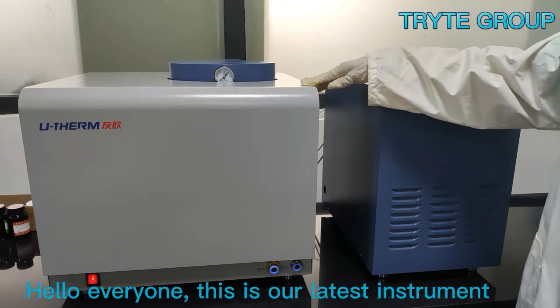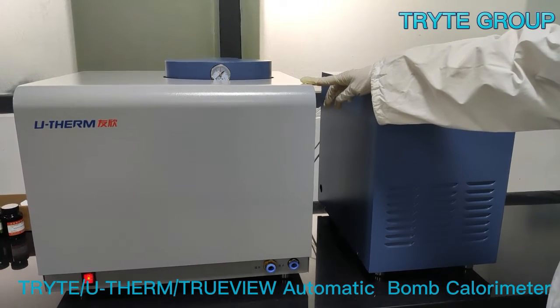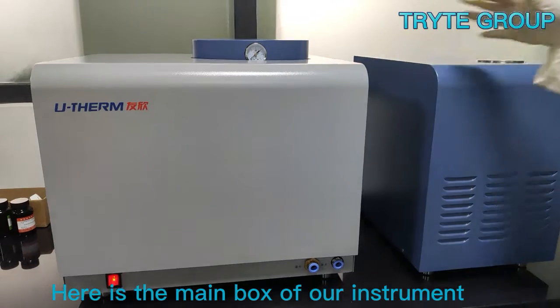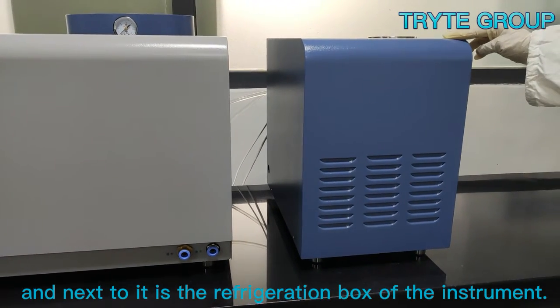Hello everyone, this is our latest instrument, the TrueView automatic bomb calorimeter. Here is the main box of our instrument, and next to it is the refrigeration box of the instrument.